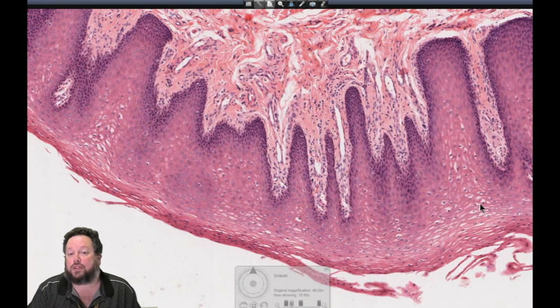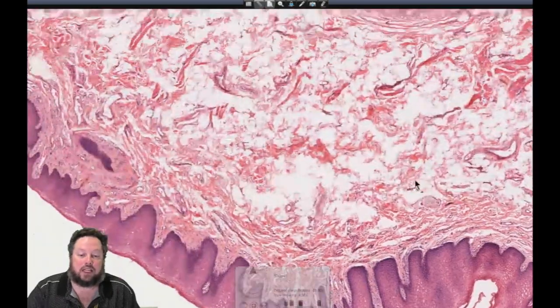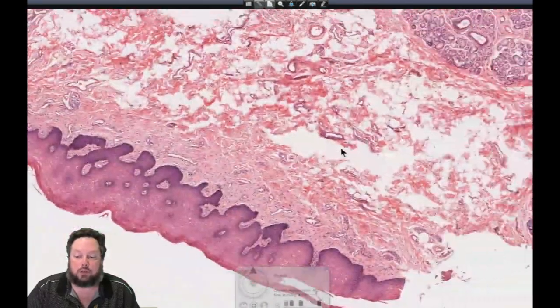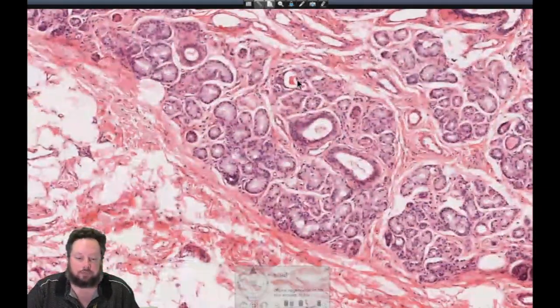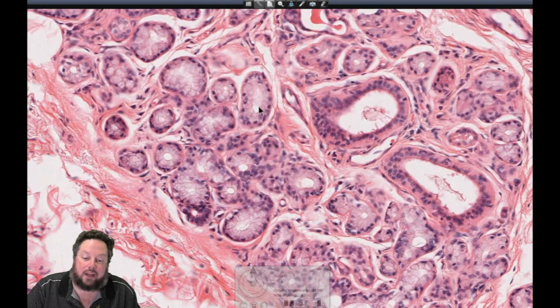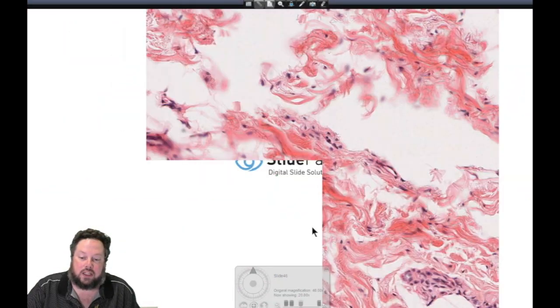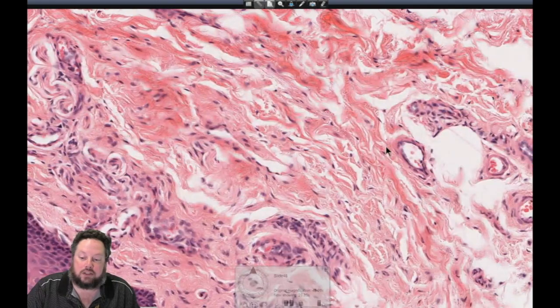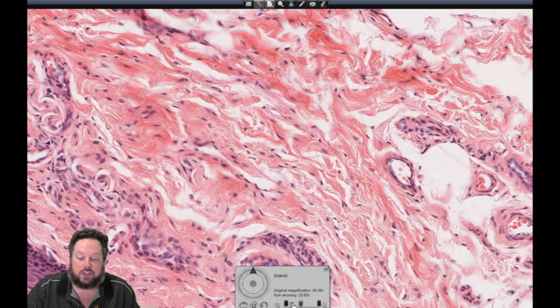Well, there's a number of different sources of the saliva in the oral cavity. One of those is actually the minor salivary glands, and if we zoom along here, we'll hopefully begin to see evidence of some of these. And this is some of what we call the labial minor salivary glands. So these are mucus secreting glands. You can see the very pale cytoplasms. These are some of the ducts which are carrying their secretions, and they would carry the secretions all the way to the surface out here. You can see some blood vessels over here, but eventually they'd empty their secretion onto the surface there.